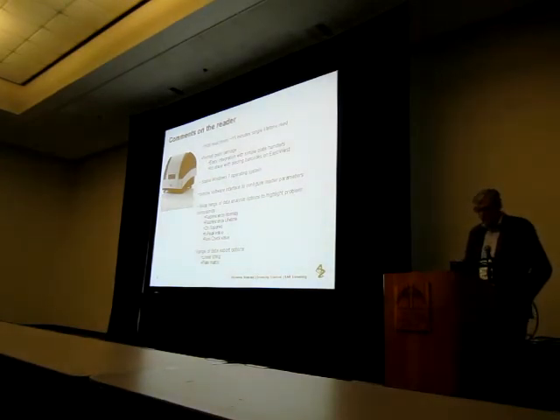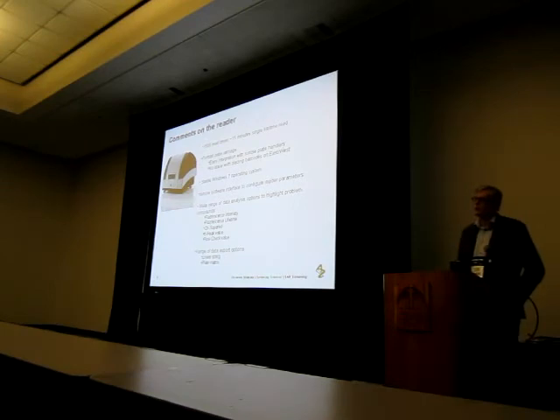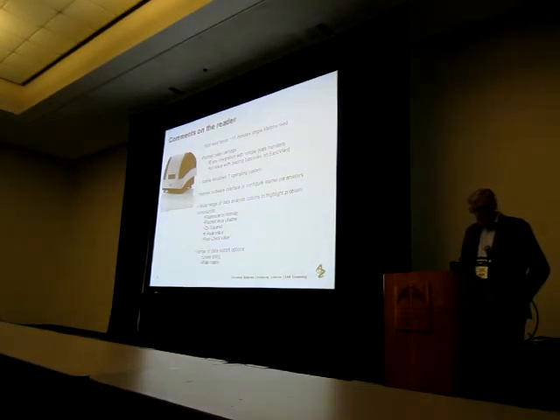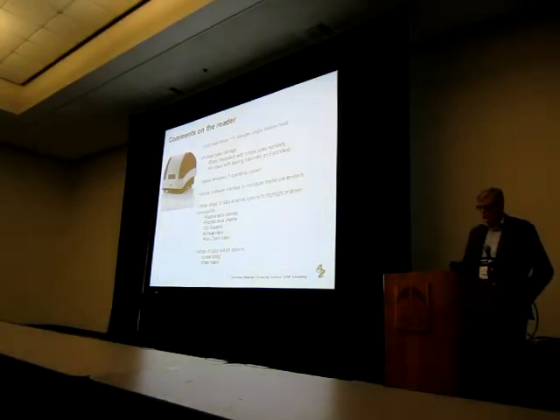The PC ran off a Windows 7 operating system, and for the duration of the time we had the instrument in the lab, we didn't have any great issues with either the software or the operating system. So it seemed like a fairly robust software platform. The operating software itself is pretty straightforward. It's not particularly complicated to set up, and I've got a screenshot on the next slide that will show you roughly what to expect and how to input the data so that the files are generated appropriately.